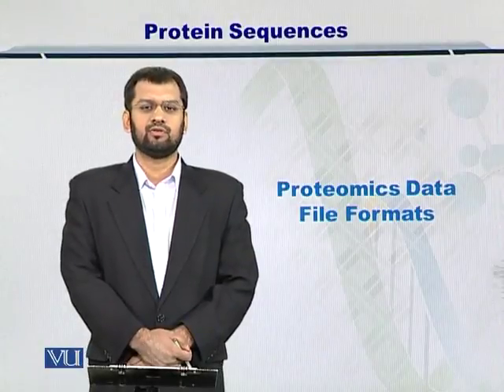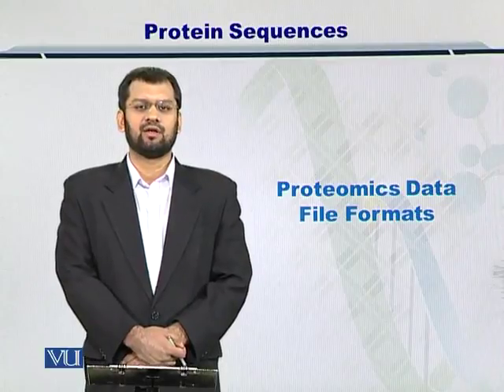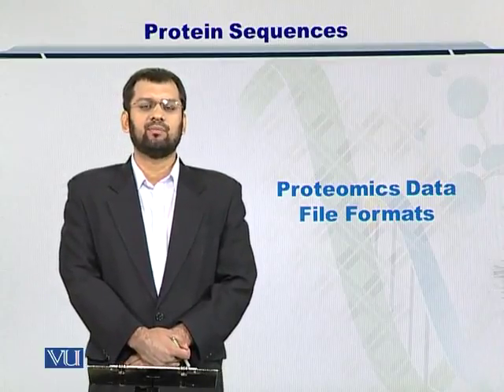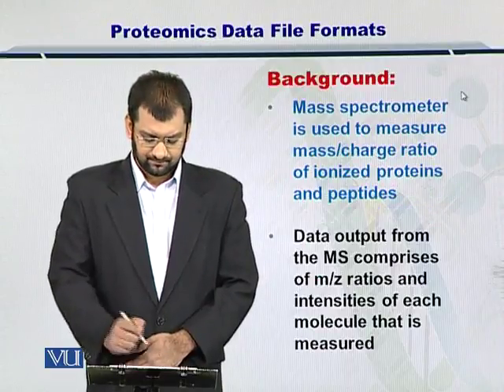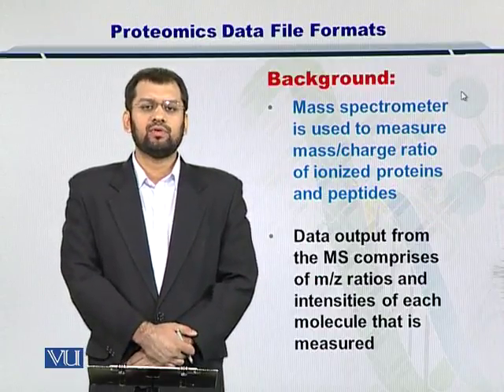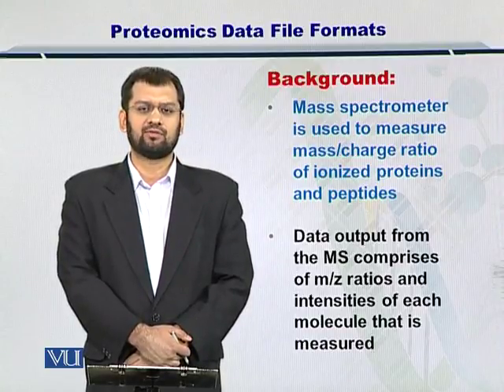Dear students, in this module, I'm going to talk about the data file formats that are there to contain the mass spectrometry-based proteomics data. You would know that a mass spectrometer is used to measure the mass over charge ratios of proteins or peptides.